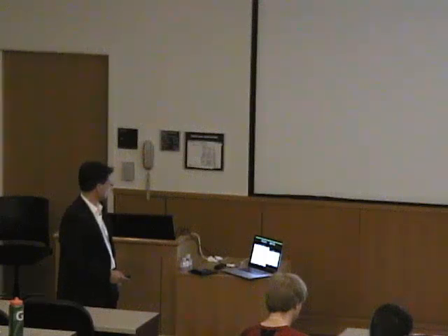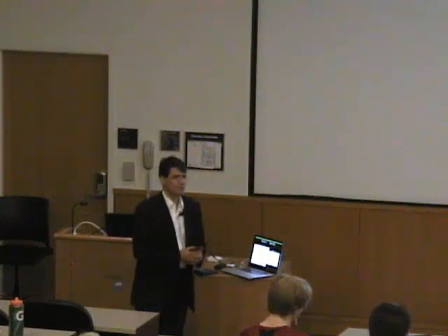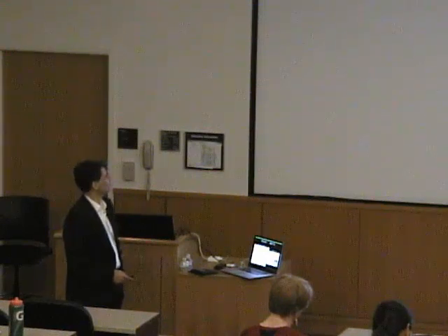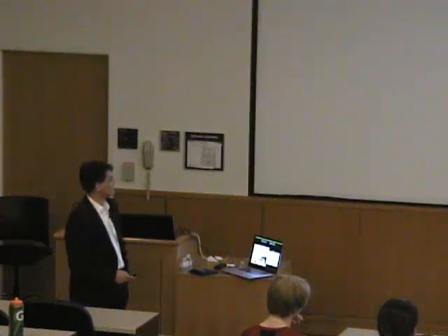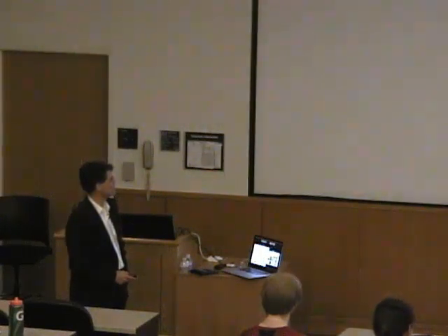Good. Now we come finally to MCD spectroscopy, that we have reiterated, and we ask ourselves, MCD spectroscopy, how and why? If you ask yourself, why should I care, then watch, and it's right. So now I've set you up so that you should care. And I hope at the end of the day you are convinced that it was worth it.